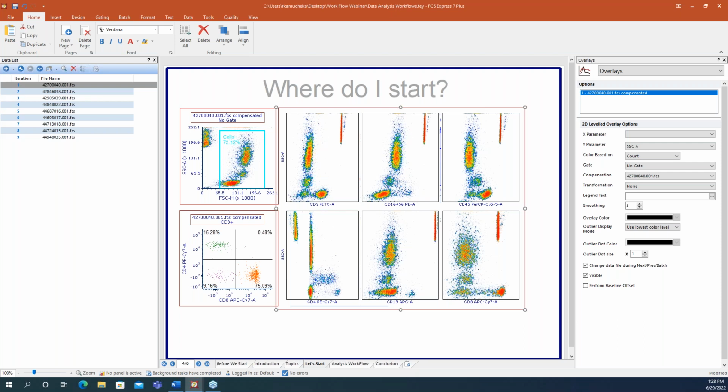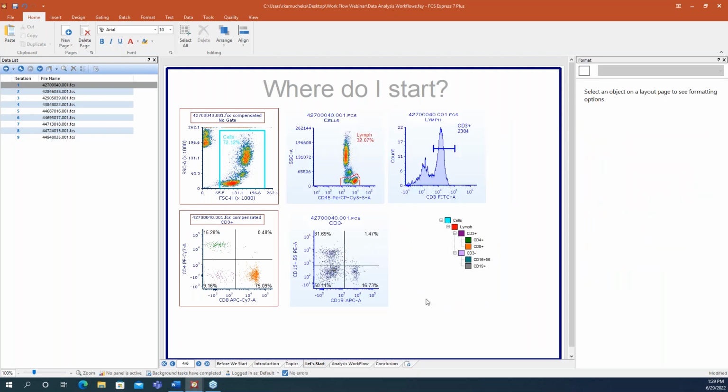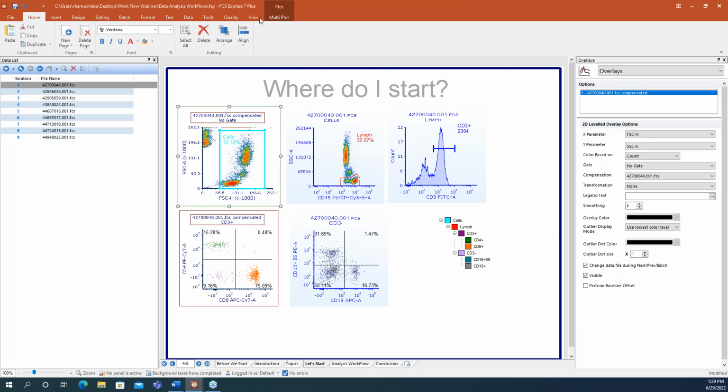If I just wanted to put eyes on things, just see how things are going across an experiment, this can be really useful. This can be useful for controls, FMOs, you name it. There's a different feature, compensation actually, is what I was trying to go with. You can evaluate your compensation by doing N by N compensation plots. It has quite a few uses there on that multi-plot tab.